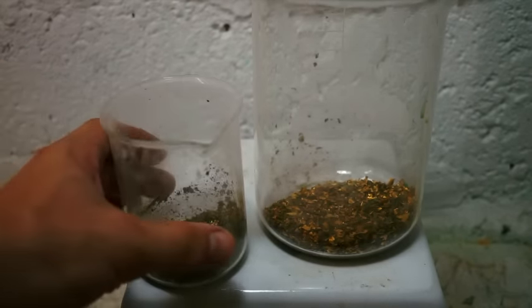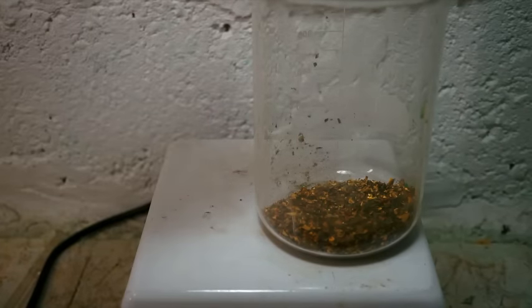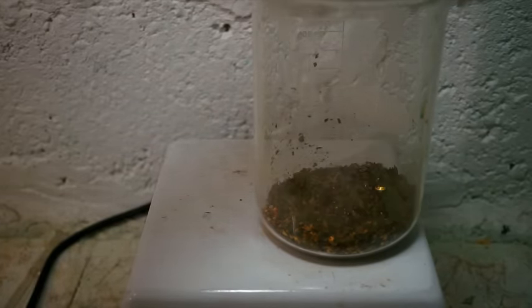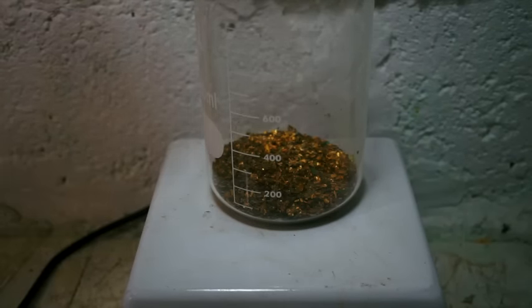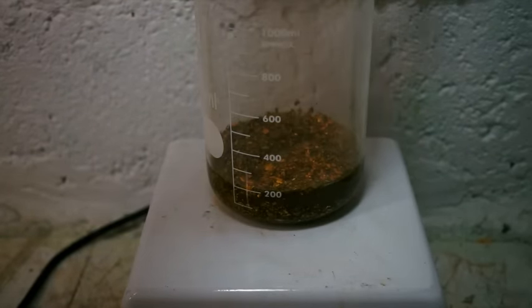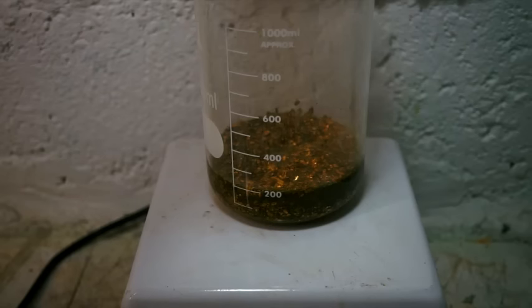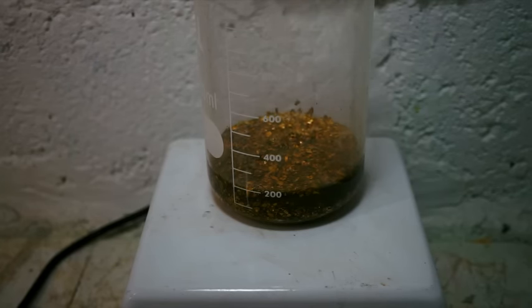We will now combine the gold foils so we can remove any remaining contamination. We will start with 200 milliliters of hydrochloric acid. Mine only appears yellow because I used the beaker that had the gold foils in it to measure the 200 milliliters.